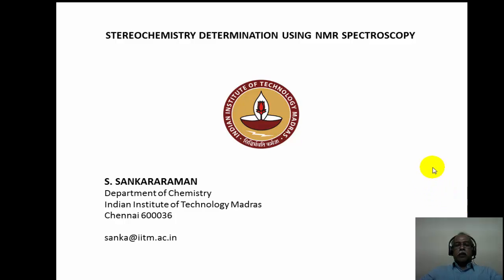Hello, welcome to Module 11 of the course on application of spectroscopic methods in molecular structure determination. We will continue with NMR spectroscopy and look at the use of NMR spectroscopy in stereochemistry determination in organic compounds. Stereochemistry is a very important topic in organic chemistry, and determining the relative stereochemistry or absolute stereochemistry of organic molecules is a very important task in day-to-day research.